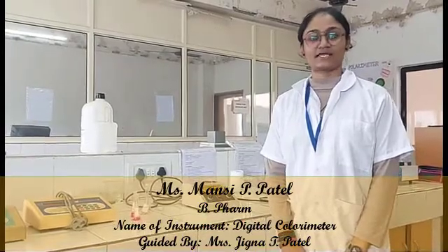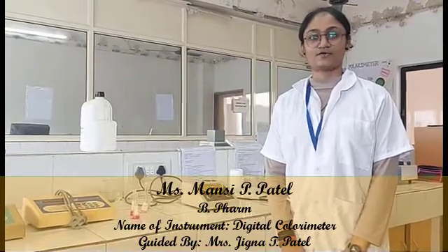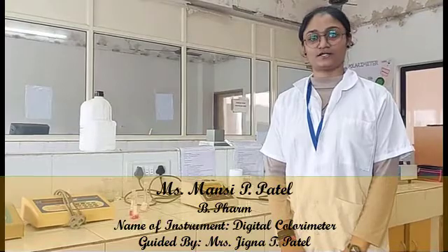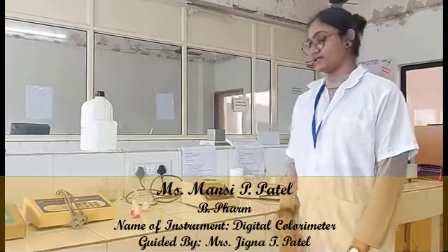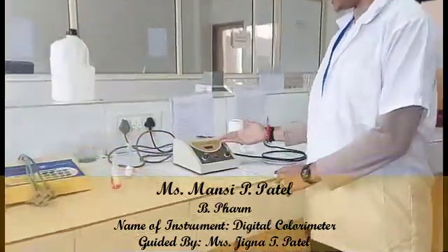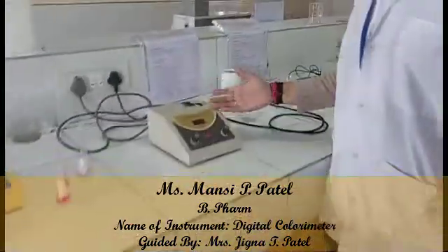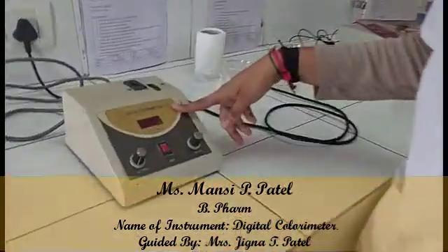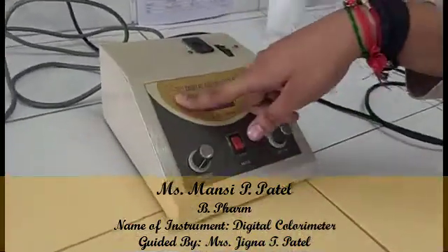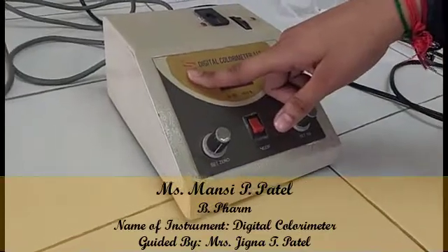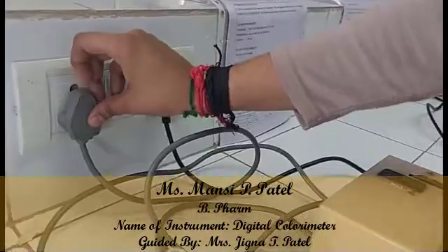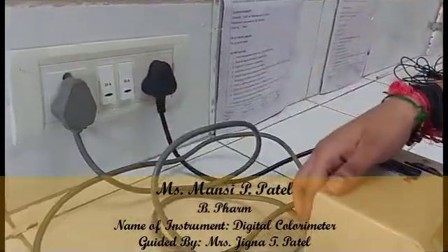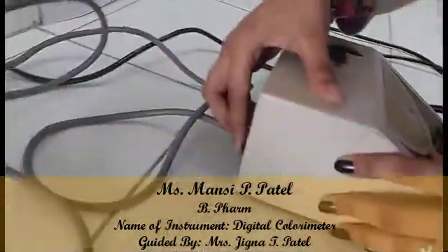Today I will explain about how to operate an instrument called a colorimeter. This is a colorimeter, model number 112, manufactured by Sistronic. Plugging in and powering on.